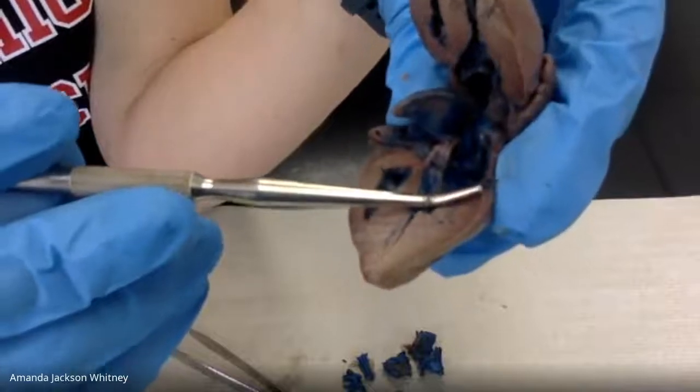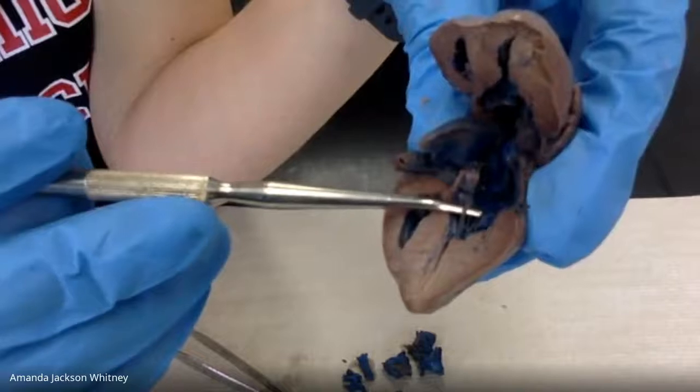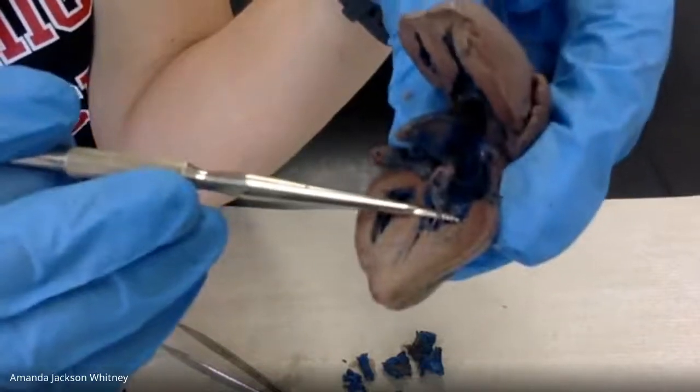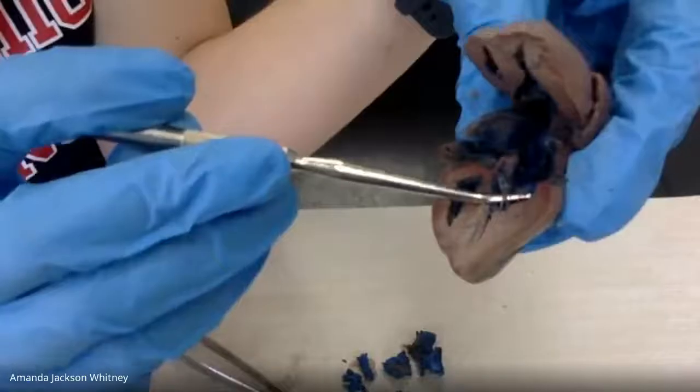Anyone else? Alan, do you remember what the little strings are called? Bella, Ray? I remember it, but I don't remember it. I know. It was a while ago. The chordae. Tibia. Chordae something. It starts with a T or something. Yeah, good. Yeah, the chordae tendineae.